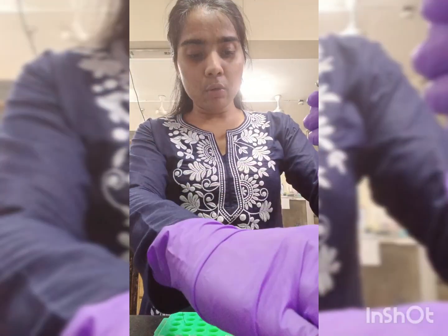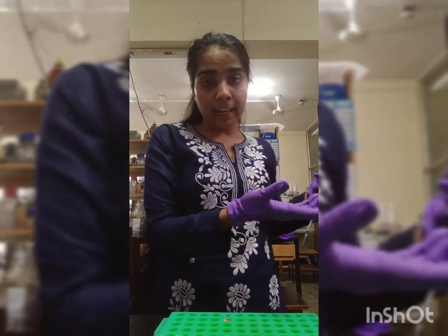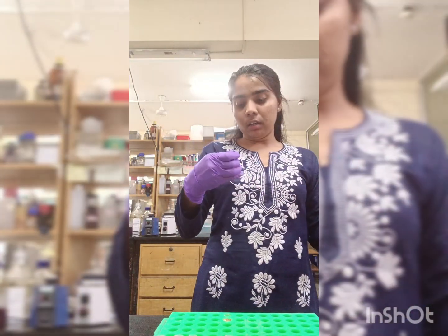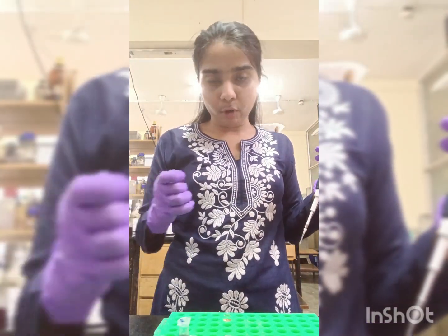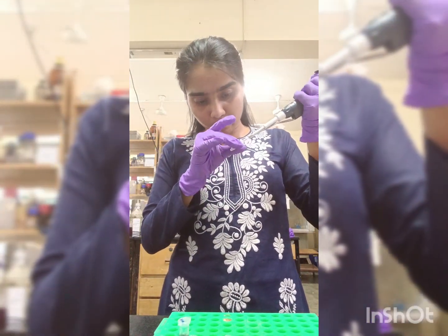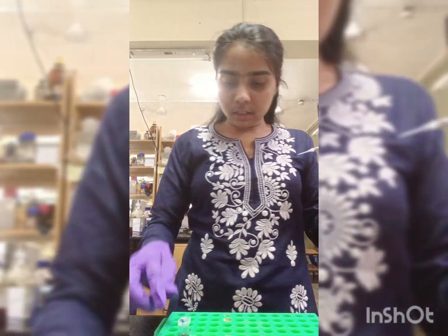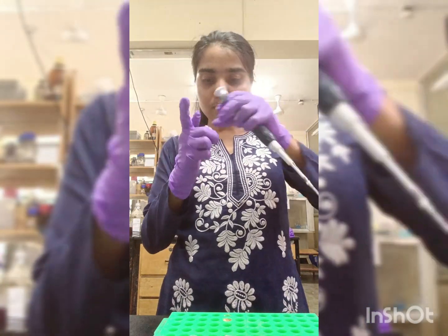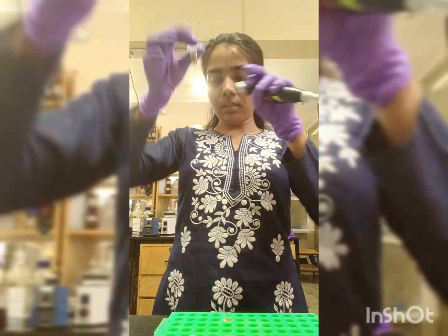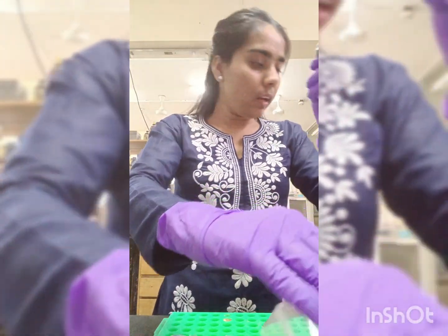Make sure your pipette is good enough and calibrated properly. Otherwise it will take the wrong amount, and you will get a wrong measurement. So make sure of that. First I will take RNA polymerase. I am doing this because of one of my assays, for which I need the concentration. First I will add RNA polymerase. I'll shake it properly so that my protein is mixed well with the reagent.